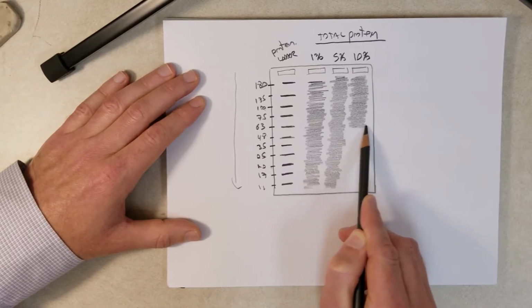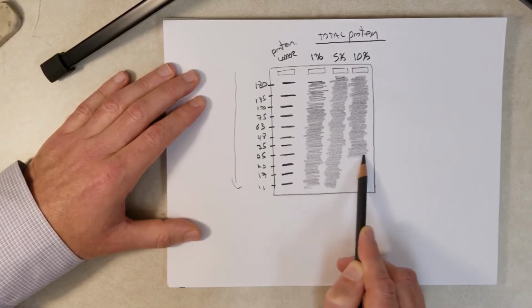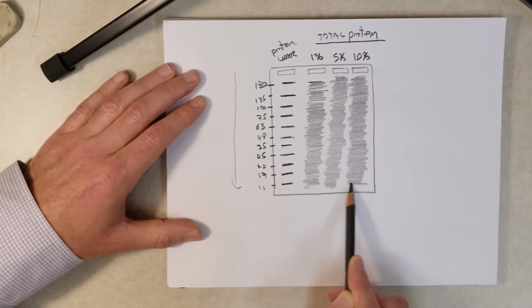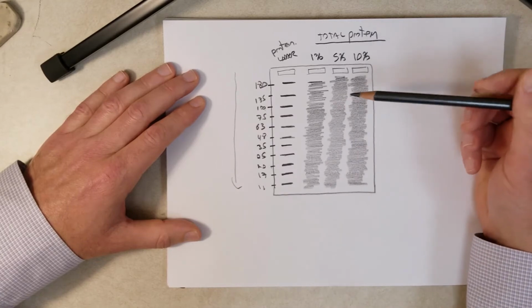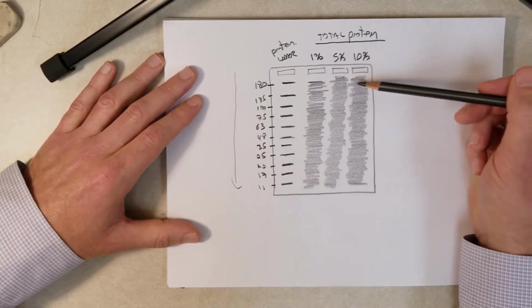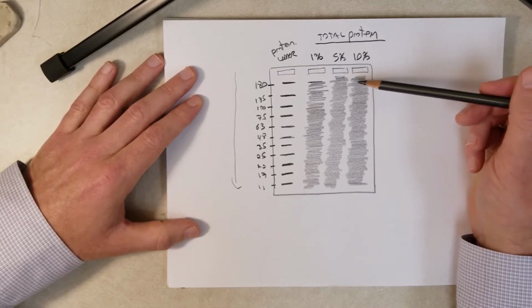It's going to be a lot of different proteins. So you can see right here that electrophoresis on its own isn't very useful for giving us information on which of these conditions produces more of the flag CDC45 gene.